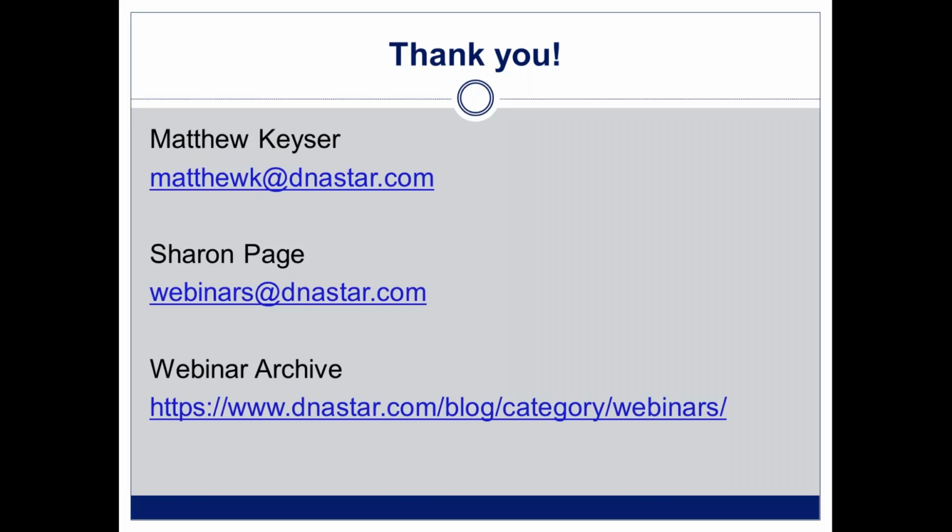So the first question is, can Sanger data be used in metagenomic assemblies? Yeah, I showed 454 and Illumina data. We also have the capacity to take Sanger data and align it the same way. Sometimes the metagenomic Sanger data is a forward and reverse read that's paired together. We can do that and create really accurate consensus sequences from those, and then use those to do the analysis. So yes, both NGS and Sanger data is supported.